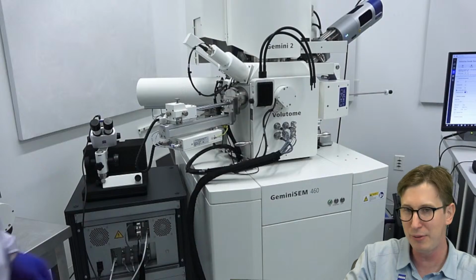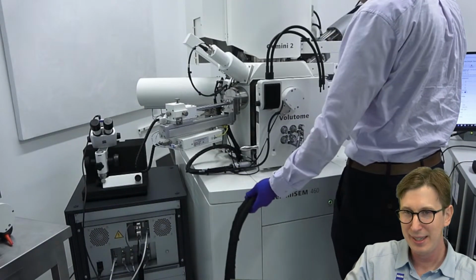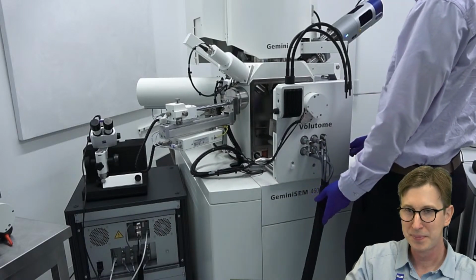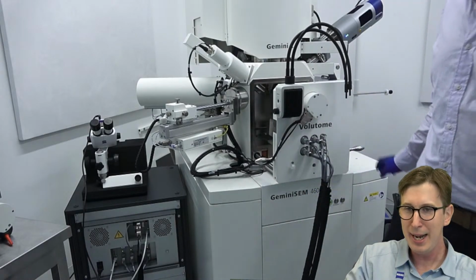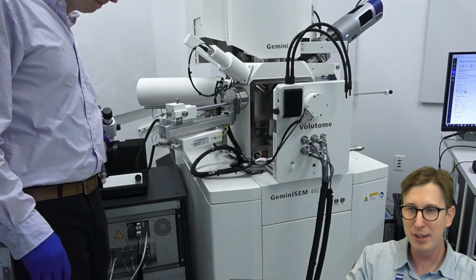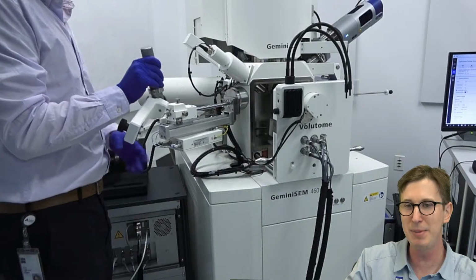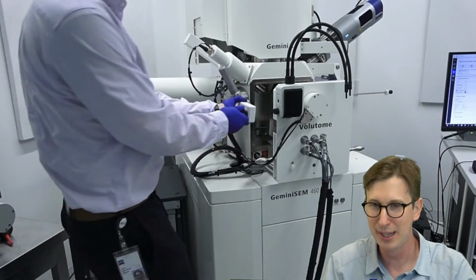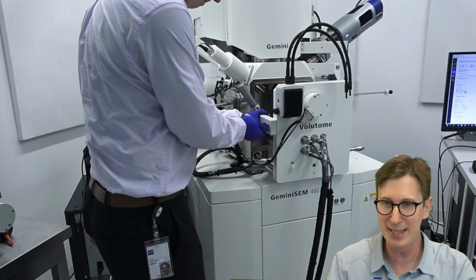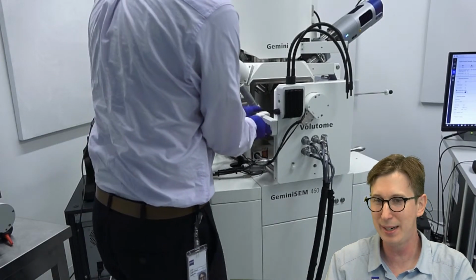So here we are in front of the Volutome. The chamber is vented and we pull out the Volutome stage. And now before I'll load the sample, we actually have another stereo microscope. Now this one is special because it's designed to be mounted on the door of the stage. So we have a specific area where that tightens in, and then I'll go ahead and grab the stereo microscope.